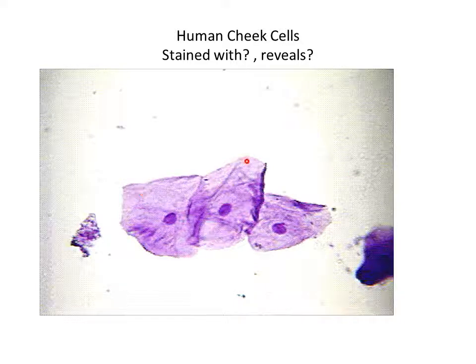Human cheek cells, we will actually swab these off the side of our mouth, and about the only thing you can see is the nucleus and then the substructure, the nucleoli. Their shape is very important, and you should know what they were stained with, which is methylene blue.